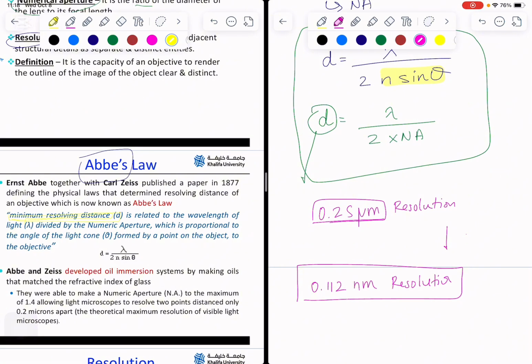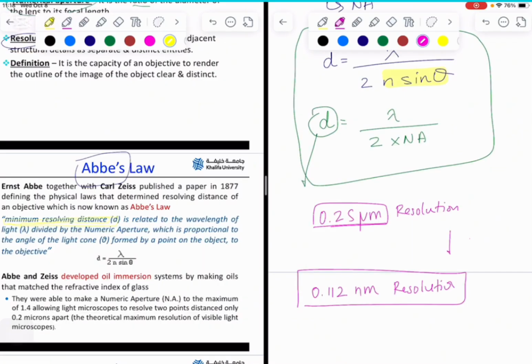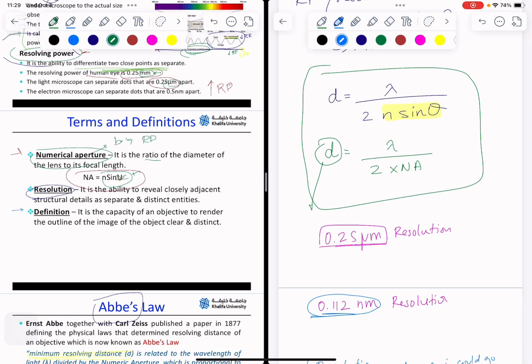This is the minimum I could reach. What this basically means is that the minimum I could reach is 0.25 micrometers, for example. Anything below that, I could not. So the minimum number is 0.25, up until whatever number you want, but the important thing is that it's above 0.25. So he has this equation.